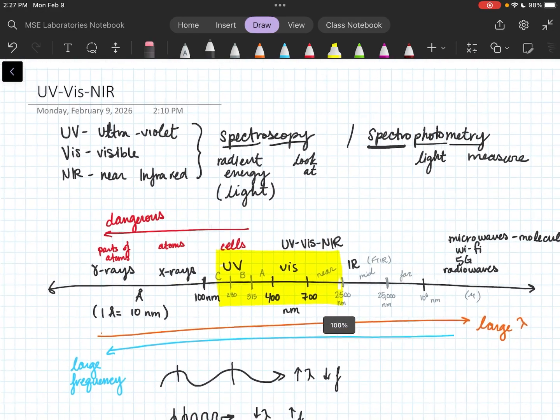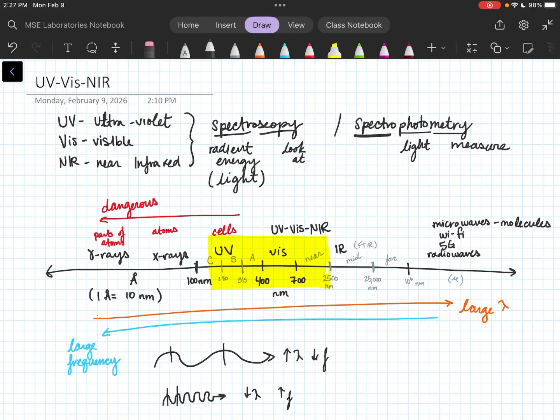That yellow is really aggressive. And then, like I mentioned, FTIR is sort of, it's not complementary, but a lot of people will talk about it within the same technologies and the same projects. You'll have UV-Vis and FTIR both getting run. And that is just mid-IR, so that's just above the UV-Vis range.